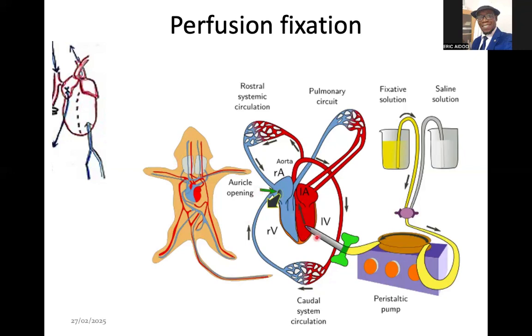So this is just a diagram to illustrate what I just said. So you introduce this. So you have the fixative here in yellow. That is a saline together. And then you put it in the left ventricle.